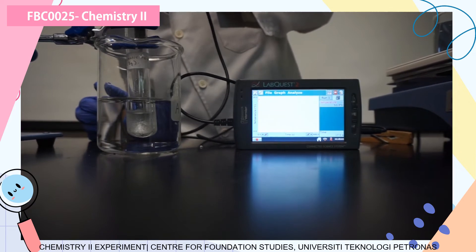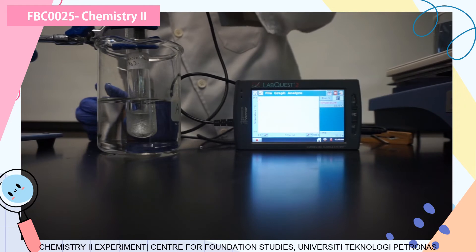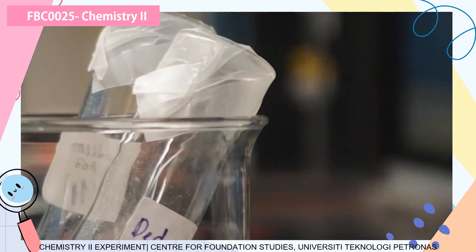You have to be careful. Be gentle. Make sure you don't sprinkle the benzoic acid all around, or else your data will not be very accurate. Make sure you put it all into the boiling tube and wait for it to be melted. Once it is all melted and mixed well, you are going to collect the data again. Follow the lab manual. This function is just to allow you to visualize how to set it up.